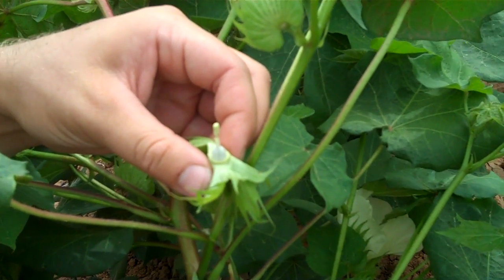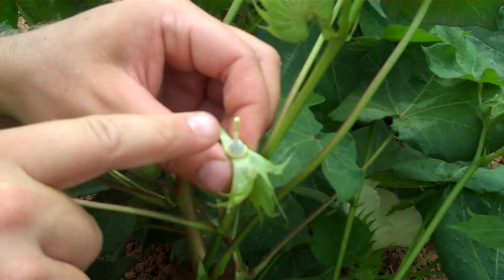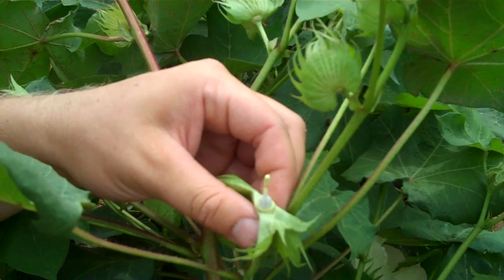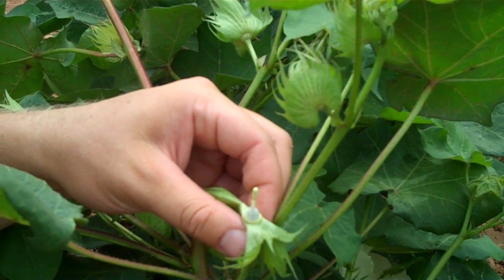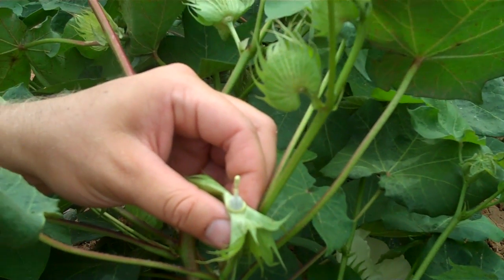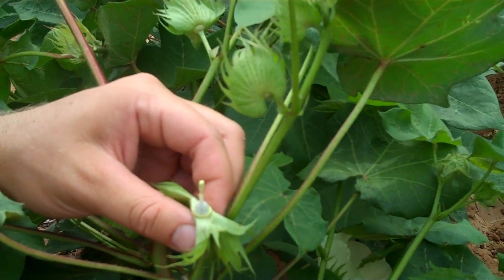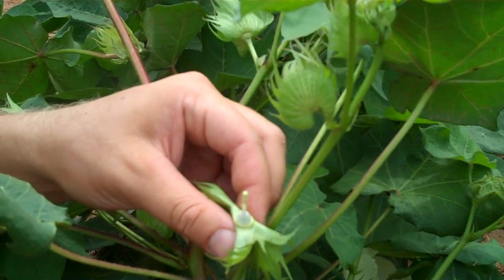So you've removed all the anthers? Removed all the anthers. The only thing left is the stigma right here. And what time of day do you typically do this? In the afternoon. And what time will you make the cross-pollination? Between about 9 o'clock and hopefully by 11 to 11:30 tomorrow morning.